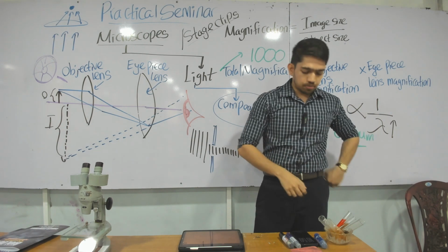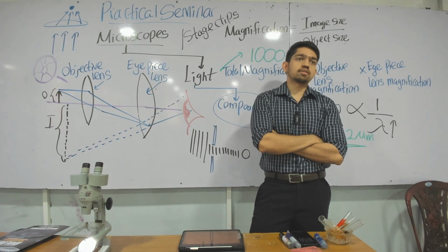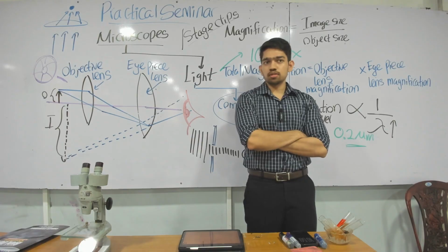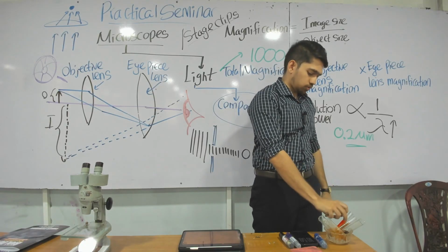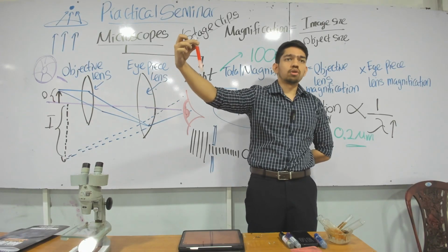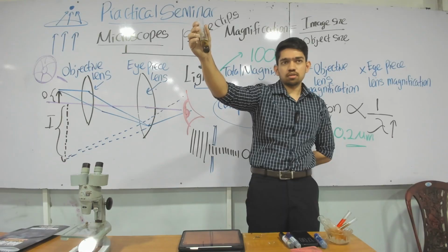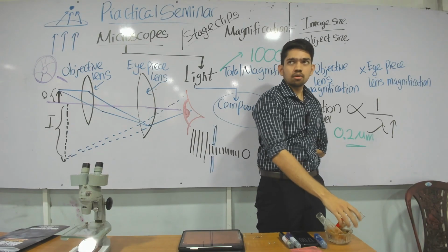Non-reducing sugar: what are the steps? You add a weak acid, then you boil, then you neutralize with a base, then you do the Benedict's test and it's going to be positive. Then for starch, the yellow-brown iodine is going to become blue-black. For lipids, when you add a non-polar dye to any lipid, it's only going to dissolve in the non-polar lipid: the Sudan III test. Biuret test: if there are peptide bonds, it's going to be a purple color.